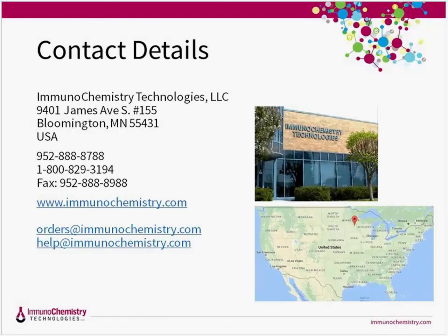Great, thanks, Tracy. Our second question, do MitoPT kits work in fixed tissues? Unfortunately, our mitochondrial membrane potential products are not compatible with fixation practices, and this is because the fixation process itself does cause the mitochondrial membranes to depolarize.